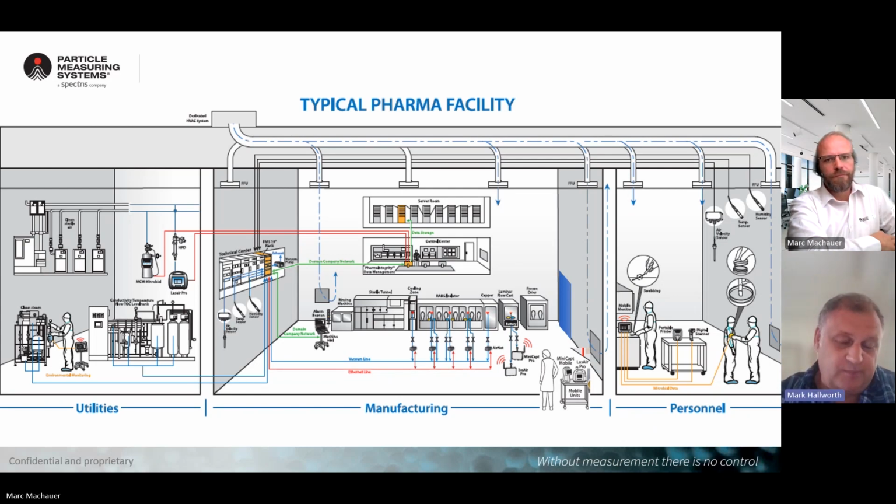Because obviously we're monitoring particles as a real-time view of the overall contamination of a fixed space, and these are ISO 5 grade A spaces. So yeah, it's been a question that's been around for a long time, and obviously with the advent of more automation, they've become a lot more popular. So we're seeing a lot of questions this last year.